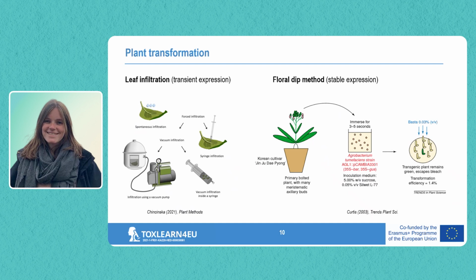But you can, of course, also work, not in the case of biosensors, but you can also insert other types of DNA, which you cannot see under a microscope because they don't generate a fluorescent protein. But then you can also screen using antibiotic resistance, because this plasmid that we're inserting into the genome, it also contains an antibiotic resistance gene. So you can also select it in that way.